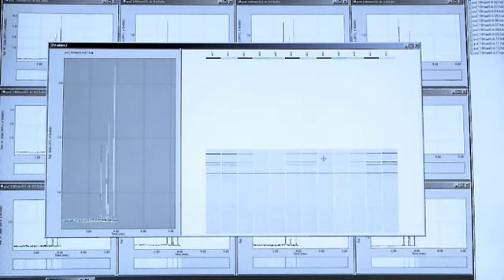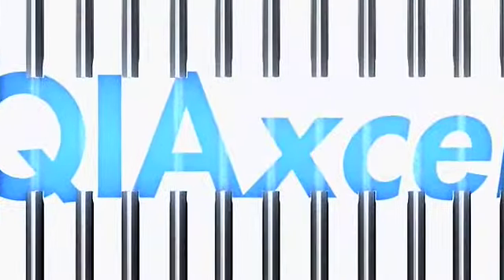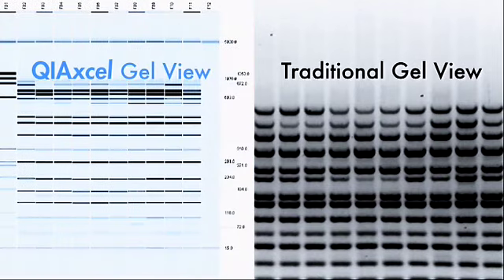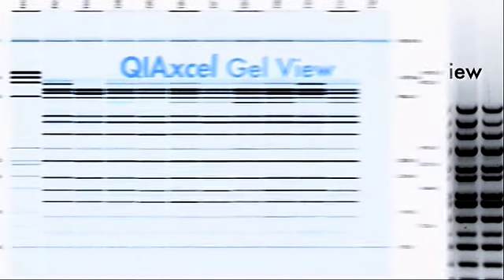Collected data is shown in real time, in both gel view and electropherogram format. The KayakCell's exceptional sensitivity provides you with more robust results at lower nucleic acid sample concentrations. Its resolution capabilities give more accurate results than traditional slab gel methods, allowing more confident data interpretation.